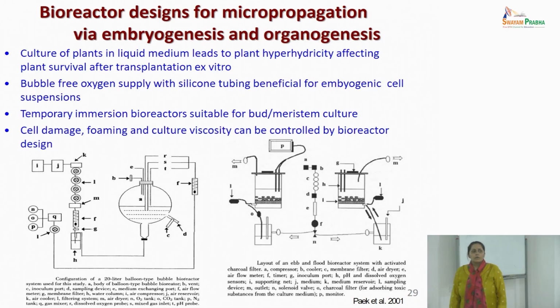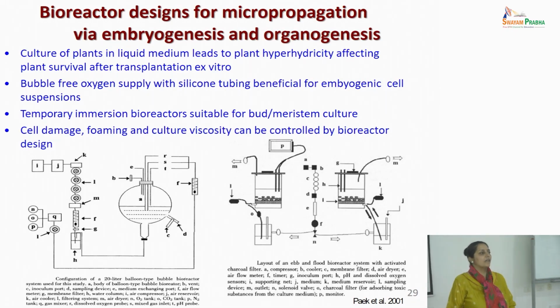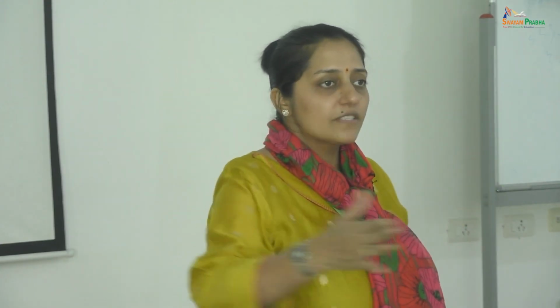But what people have also come up with as an alternative is, rather than doing a large bioreactor in production, like a 200,000 liter reactor, you can have multiple batches with a smaller size. So people like Rutec Bioactives, they have come up with a series of reactors in one line, wherein the size of the reactors have been reduced, and they are working with hairy root cultures with a smaller batch size of the reactors.